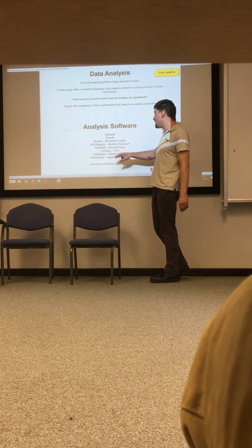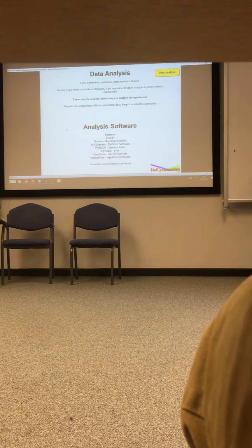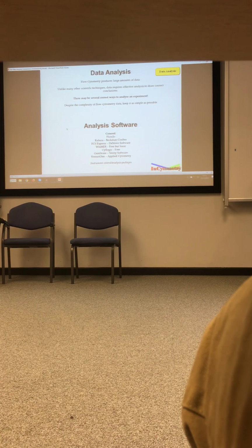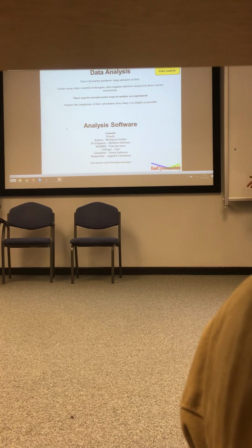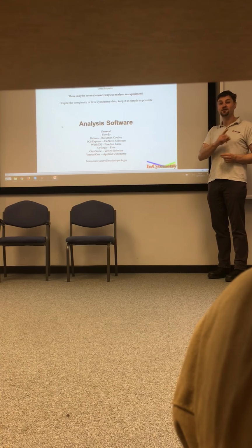FCS Express is very good. WinMDI still works on Windows 10. Now, it was originally written for Windows 3.1. Does anyone know Windows 3.1? Yeah? Not many nods. Not really very surprising. It was the one before Windows 98. So not Windows 95. Yeah. So do the maths on that.